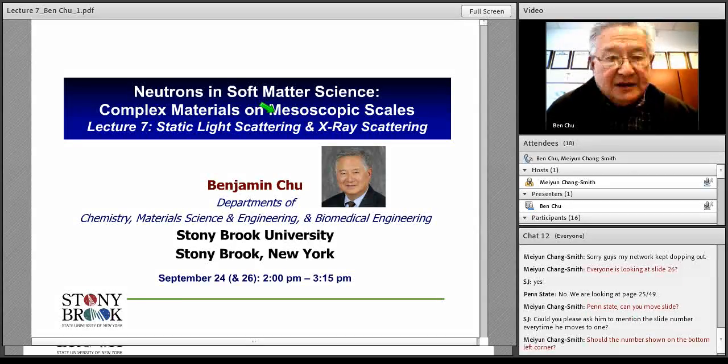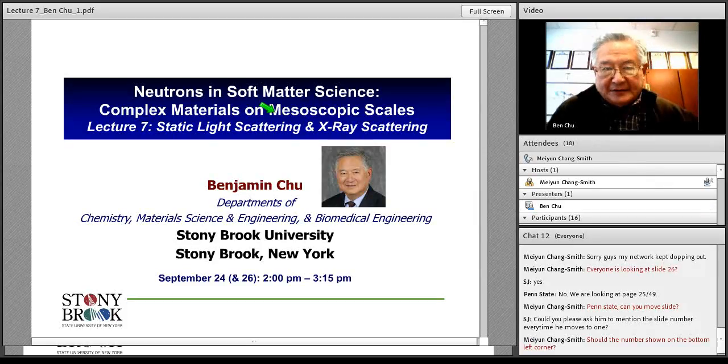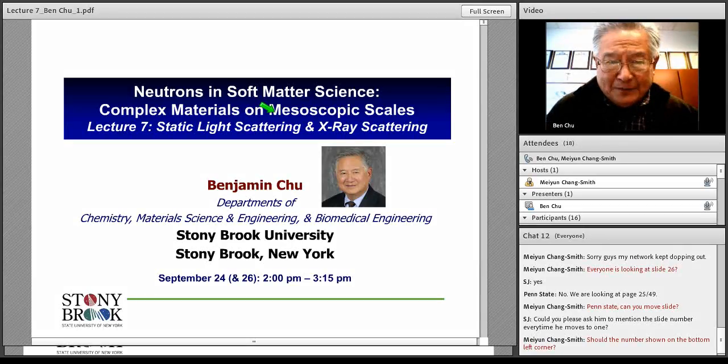So therefore, when I want to look at the signal to noise ratio, I need to also worry about the refractive index of the solute and the refractive index of the solvent. And the solvent refractive index sometimes can also be changed because, especially in biology, you have buffer solutions and different concentrations of other salts that you can use.